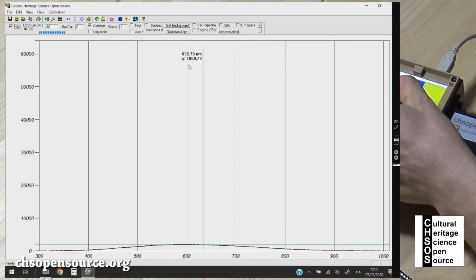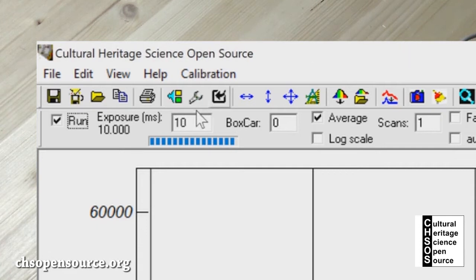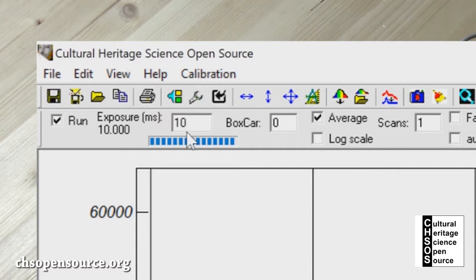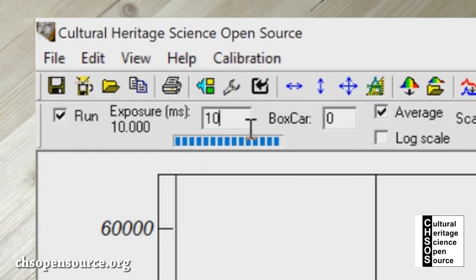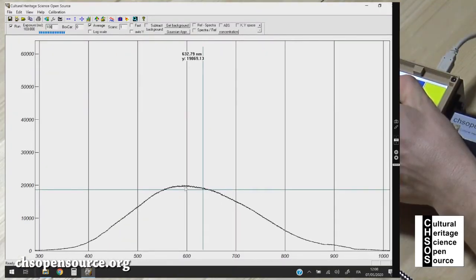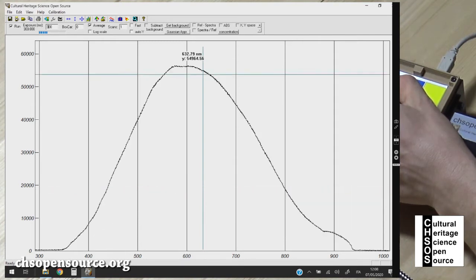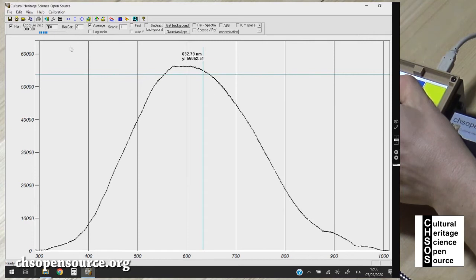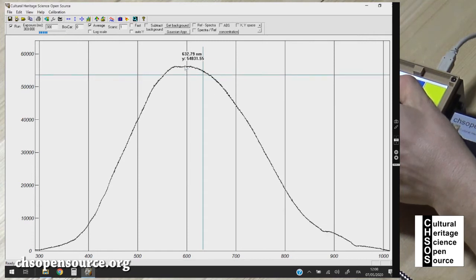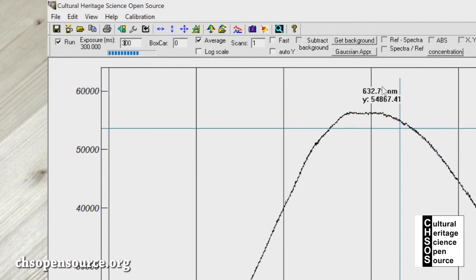To do the calibration we move the probe over the calibration target. We keep it in position fixed so there is no light leaking from the outside. We look at the software and we see now the maximum of this curve is about 2000 counts. Our goal is to increase this count until it is close to 60,000.